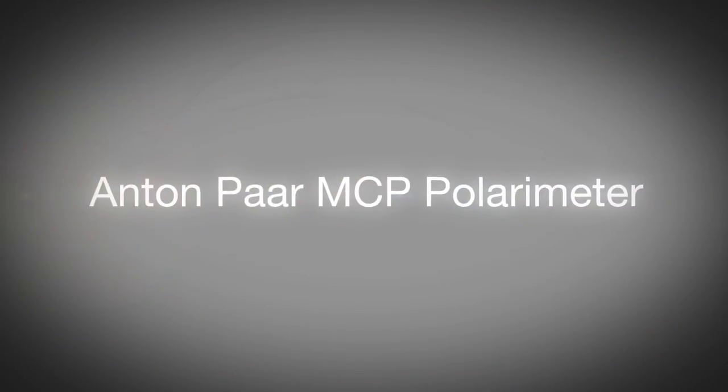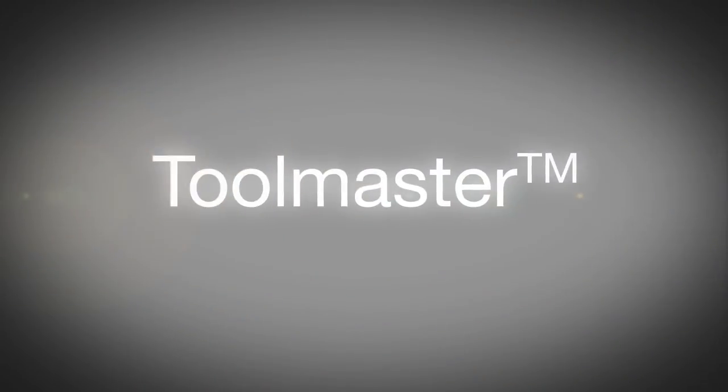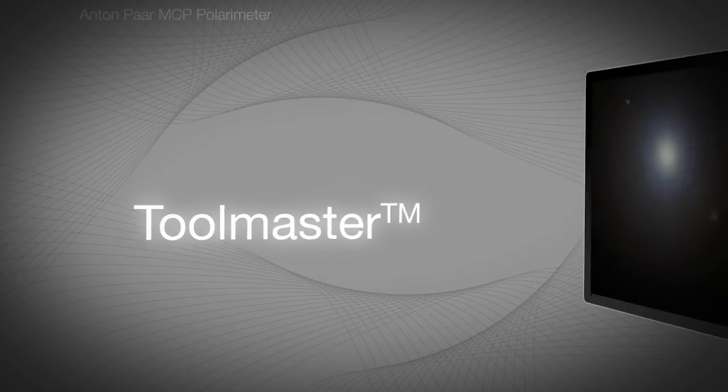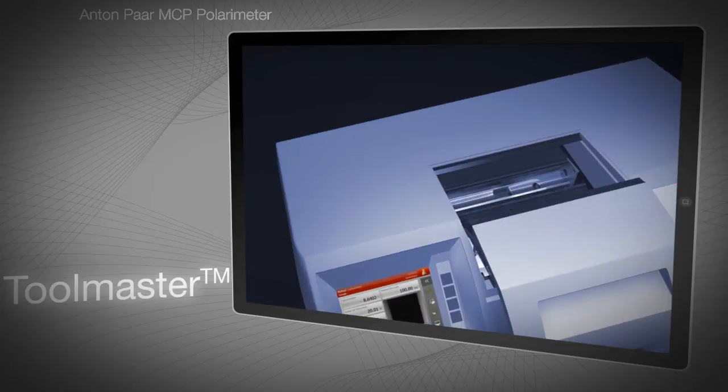The MCP series of polarimeters is produced by Anton Paar, a global company renowned for manufacturing high-quality instruments for measurement and analysis. This video explains the Toolmaster feature, which is unique to Anton Paar's MCP polarimeters.